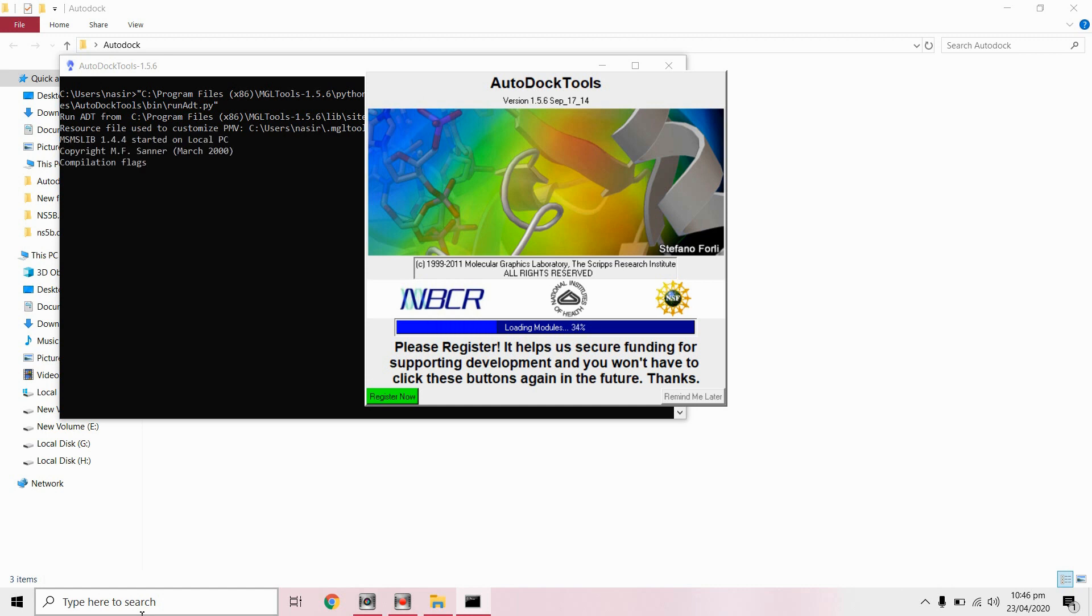First we will prepare ligand file and then our protein file and then we select parameters and docking parameters and then we will perform docking by using AutoDock.